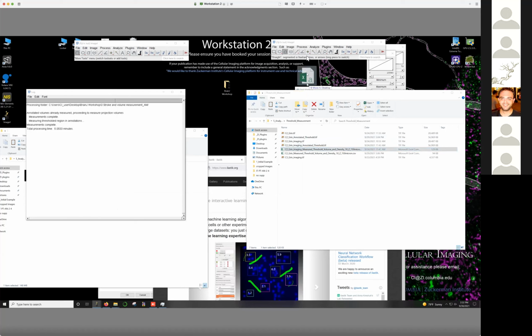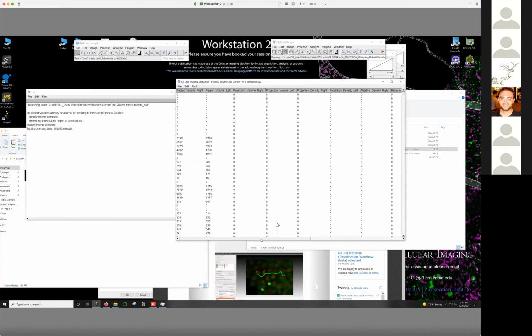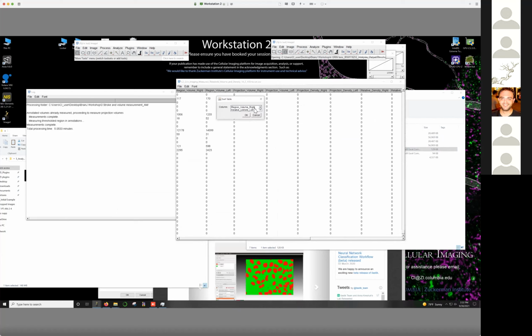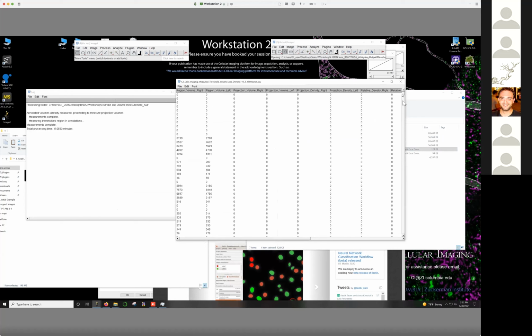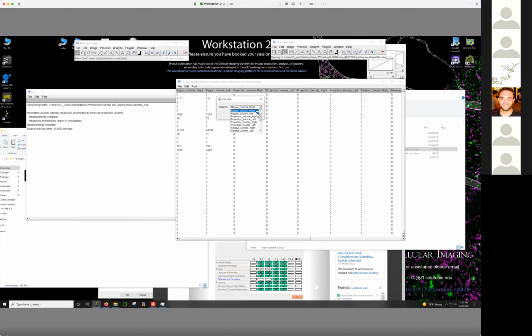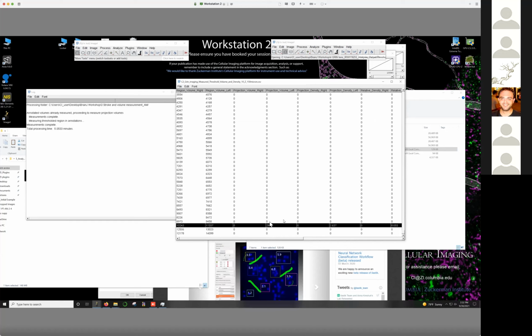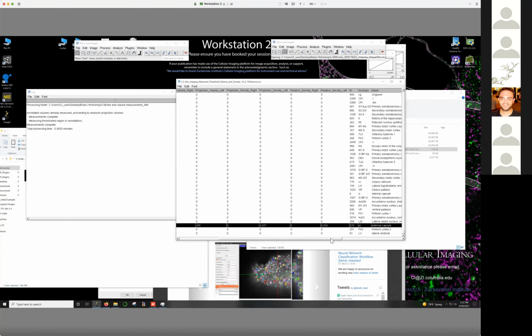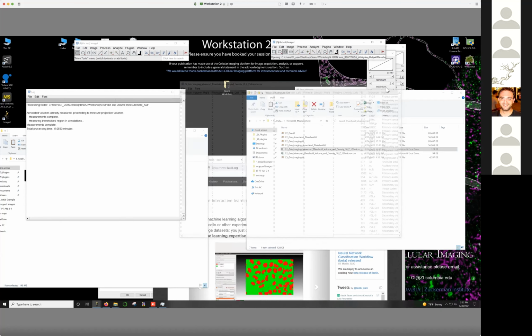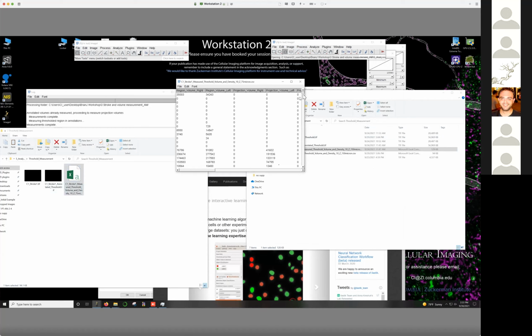So this table will then show you what the volume is for that brain region, and then what the volume is of, let me sort this so you can actually see. Yeah, so there's a very small volume of this lens imaging area. I don't know why it's not sorting properly, but that's how you can measure a brain region, and hopefully that's clear in here as well. This is our stroke, and we can see it's mostly in the left hemisphere here.